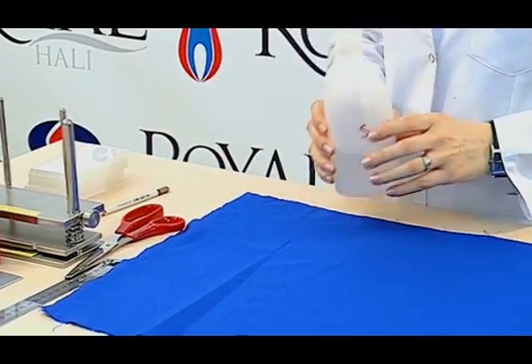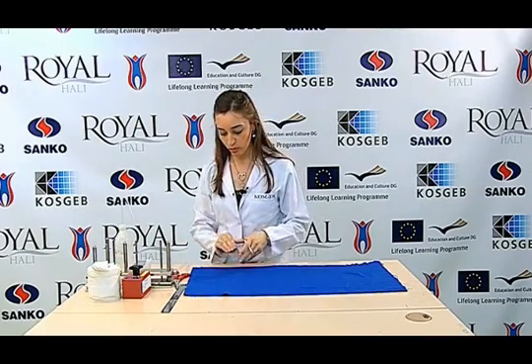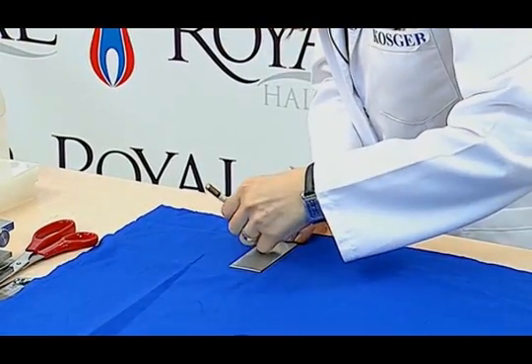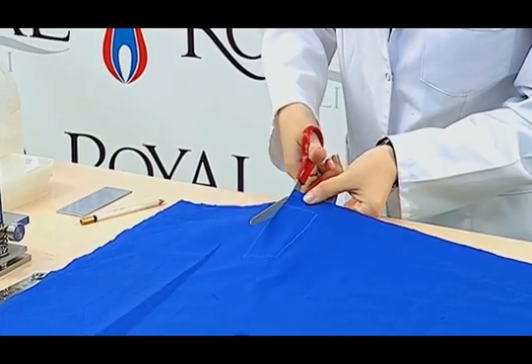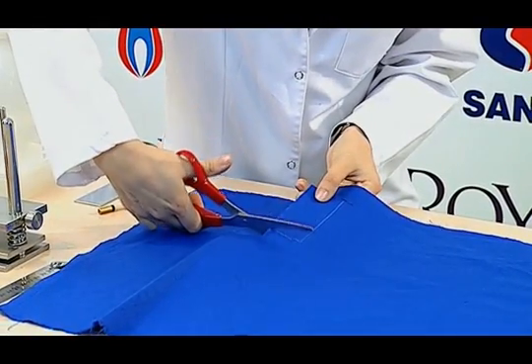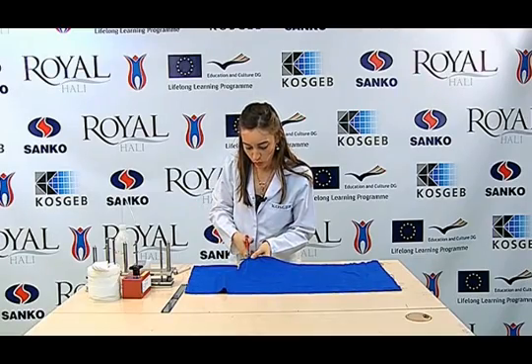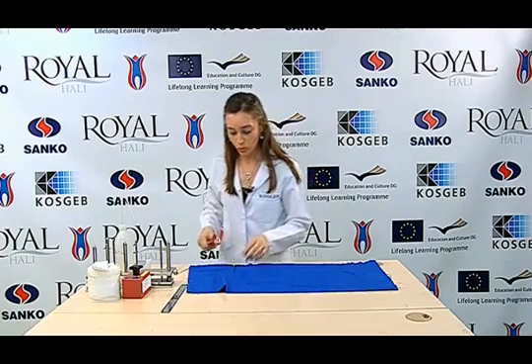As the test is about color fastness against water, we use distilled water. We can use a template to prepare the sample, or we can cut the fabric in sizes of 10 centimeters by 4 centimeters with a ruler. If there is a possibility to confuse the front and reverse sides of the sample, we can mark the reverse side of the sample to prevent confusion.